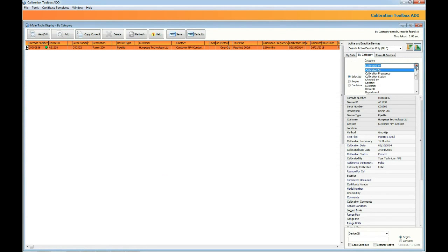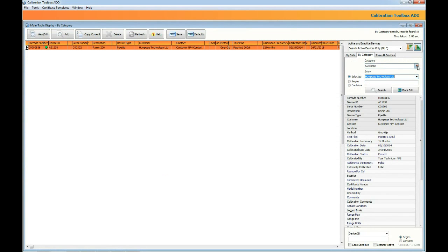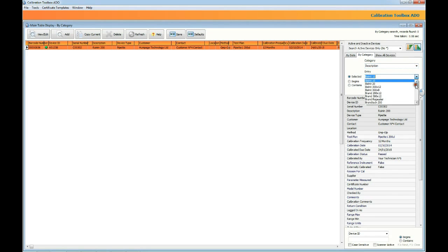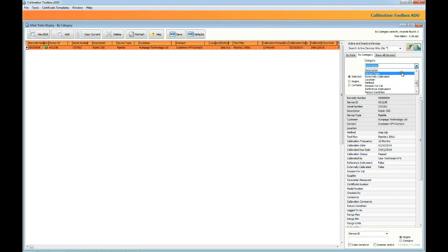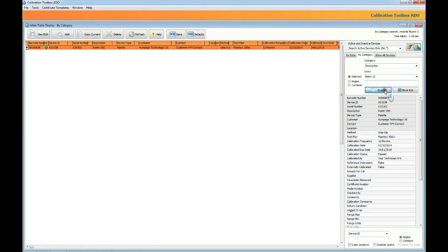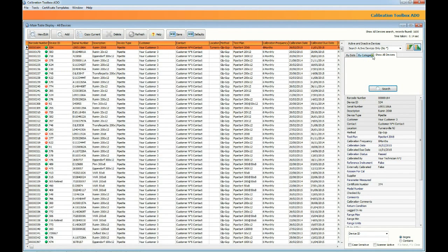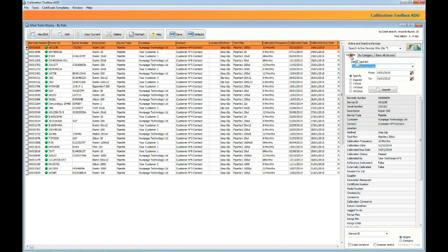You might also want to be able to see all the devices in a particular category. For example customer, test plan, device type, location, department, all those sorts of things. Now you use the by category tab for that and the first drop-down contains the categories that you can choose from. When you select any of them the entries in that category appear in the drop-down list below. So what we're going to do now is locate all the devices of a particular type. Click the search button and there they are.